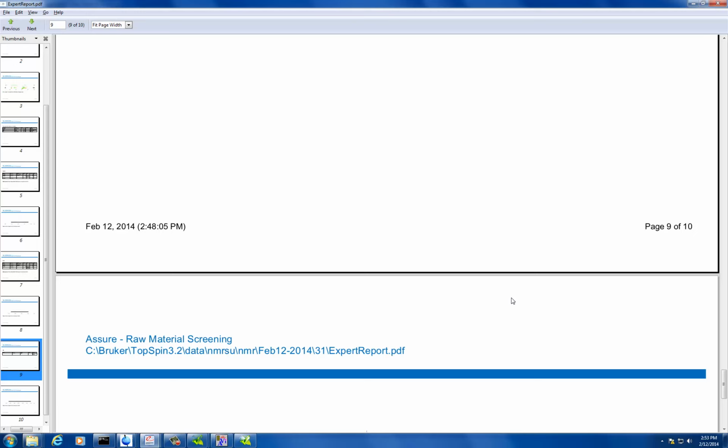So when you say expensive, how expensive are the purchased ones? I actually don't know the exact price, but do you think we'd be better off purchasing them? I mean, if it's searchable: Sigma, Cambridge Isotope, NIST has some, and Bruker, I don't know. I mean, CIL is pretty reasonably priced. Yeah, but it could be any compound. Any compound, obviously for NMR, it has to be an NMR reference. Right.